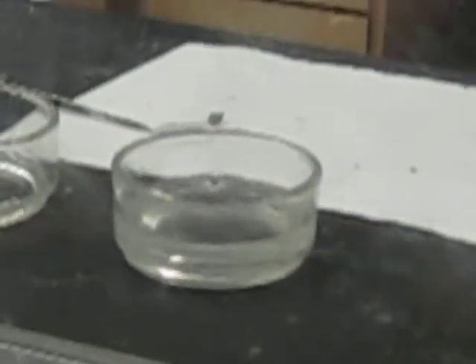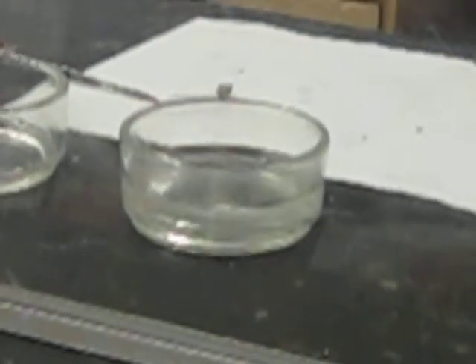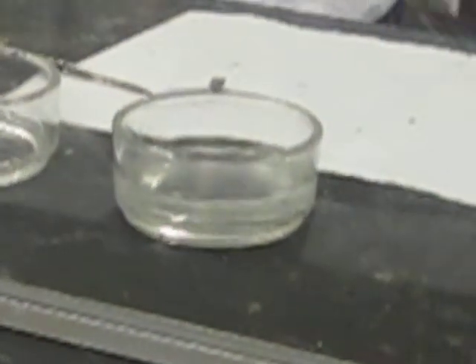And as this is taking place, what exactly, from the notes that you just took, is happening? The temperature is rising. Okay, but in terms of redox, what's happening? Oxidation. Yes, Abby, oxidation is happening. So in the water, the lithium is giving away its valence electrons. Just like Abby said, oxidation is taking place.